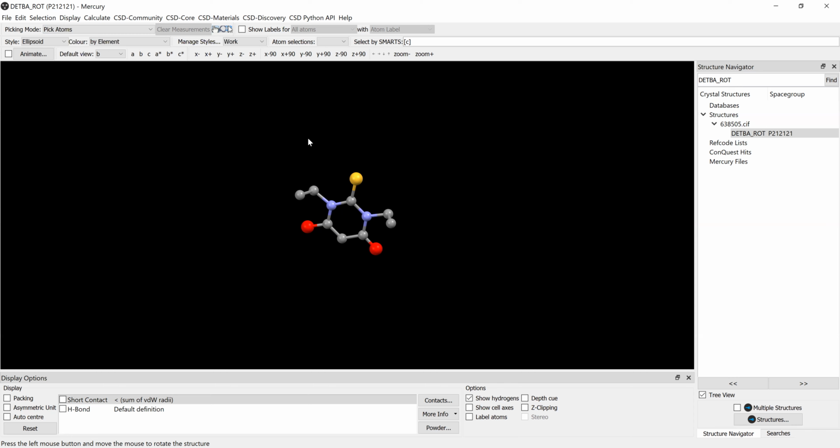For example, atoms in a benzene ring are very constricted, so there's little vibration typically in a benzene ring. Those carbon atoms don't vibrate that much. But if you have a methyl group, the methyl carbon tends to vibrate quite a bit, and that can lead to what we call disorder in the crystal structure.